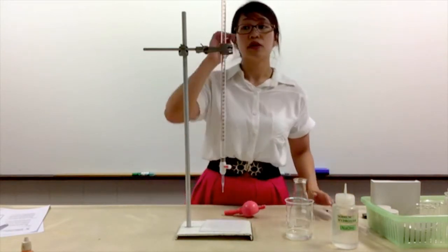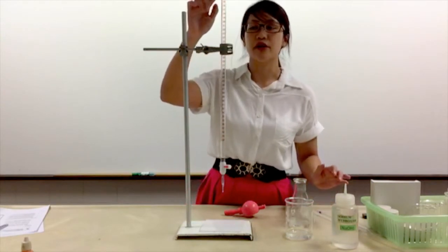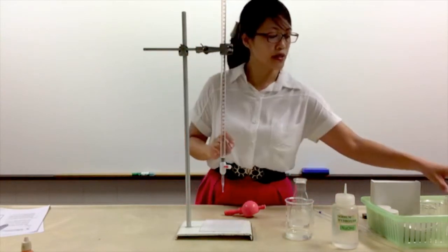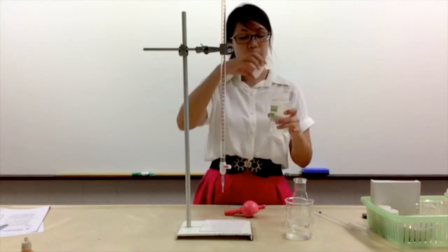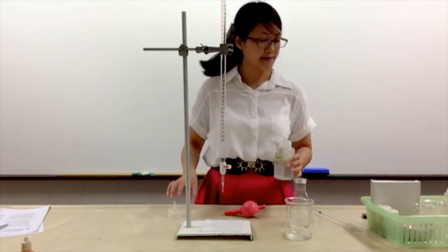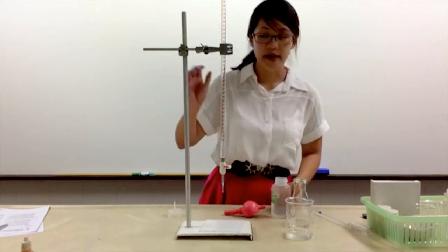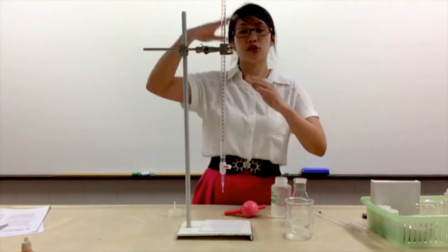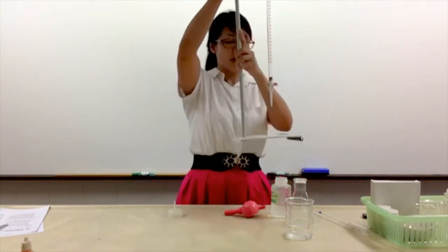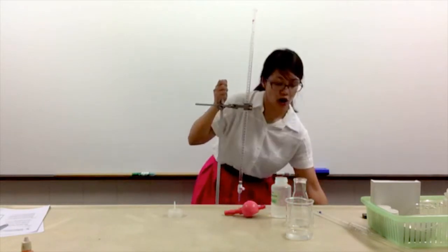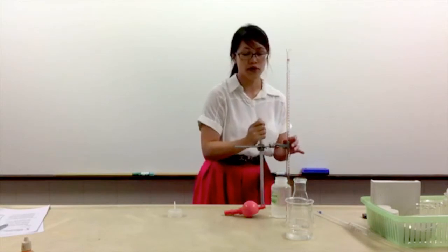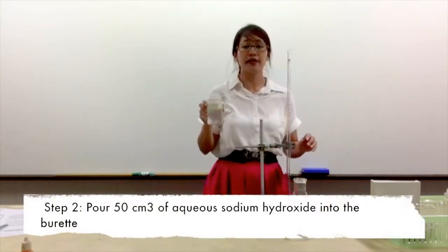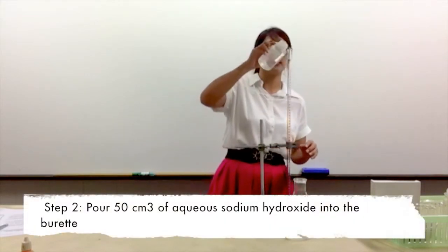Now step two: you will need to put the alkaline into the burette. Open up your bottle of sodium hydroxide. You'll realize that the burette is too tall - you may want to put it onto the floor or onto a bench so that you can pour it more easily. Pour 50 cm³ of sodium hydroxide into the burette.